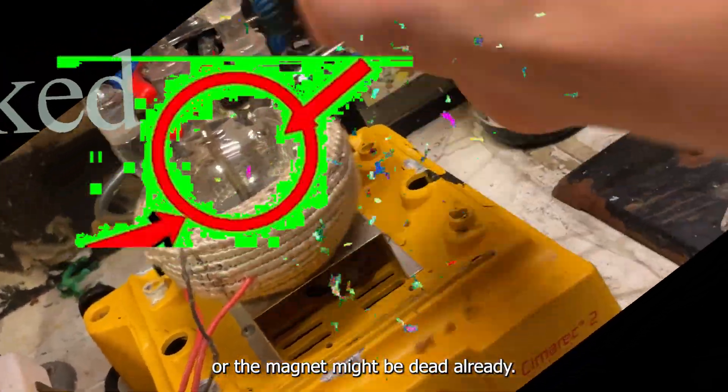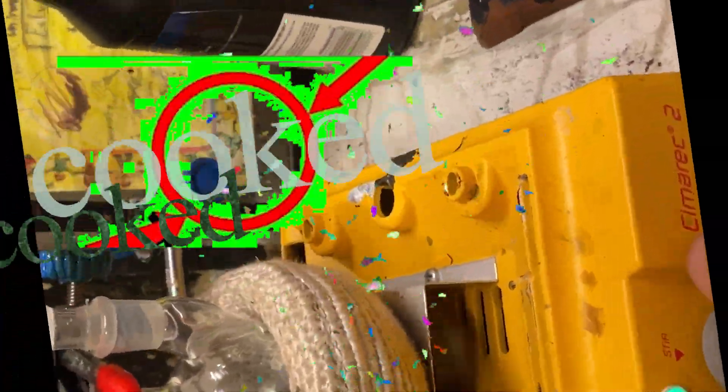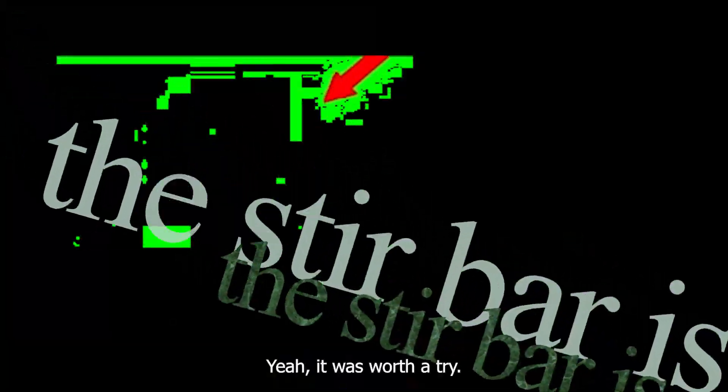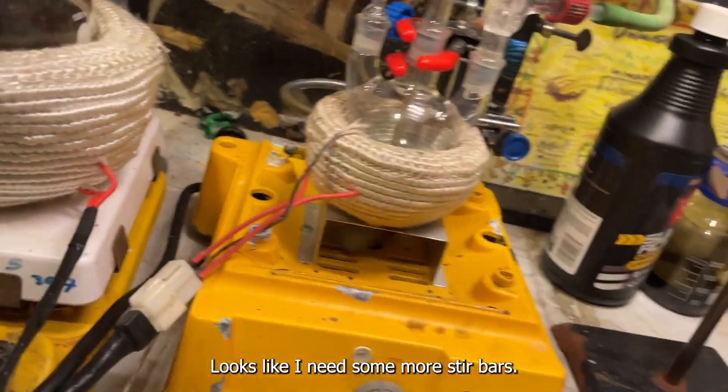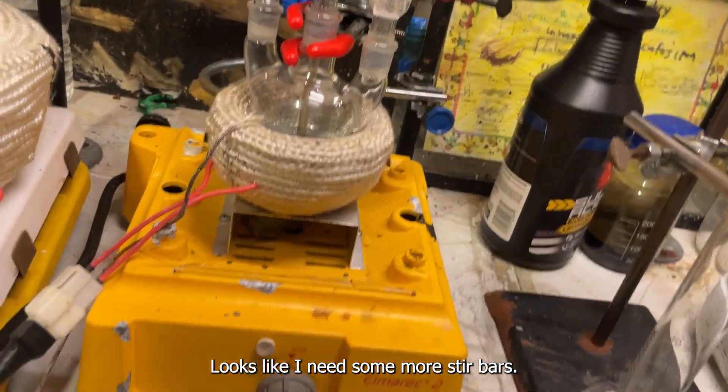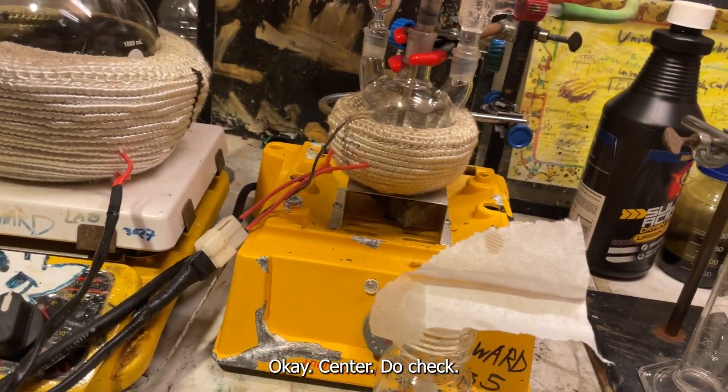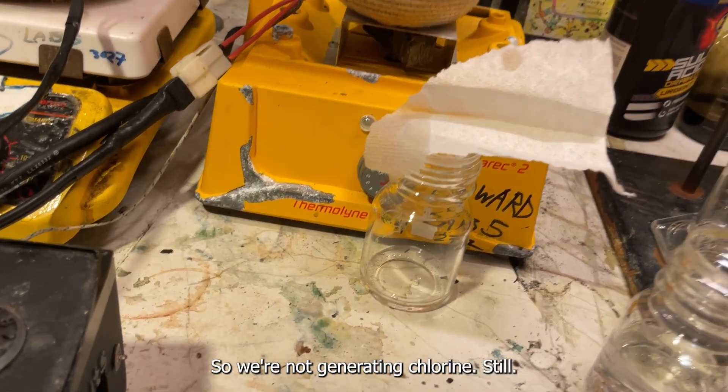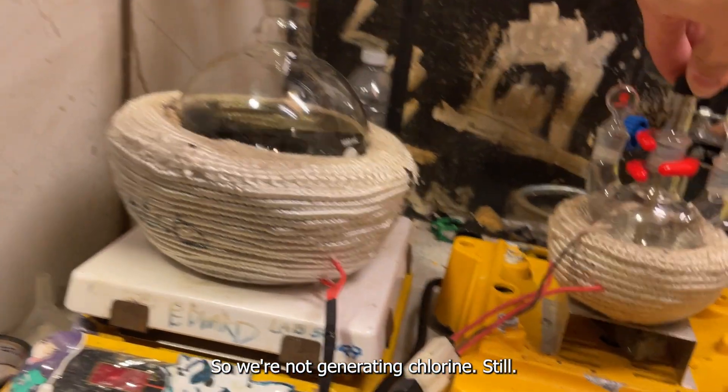I don't know, I've never done this reaction. I think it needs heat though. Okay, I got heat on full blast right now. So hopefully we should see a yellow hue and then we should get chlorine. Looks like I need some more stir bars. Okay, sanity check. That's some potassium bromide. If there's chlorine it should turn red, which it's not. So we're not generating chlorine still.